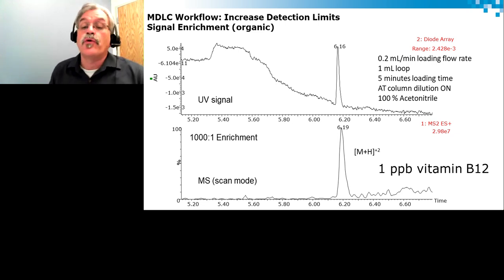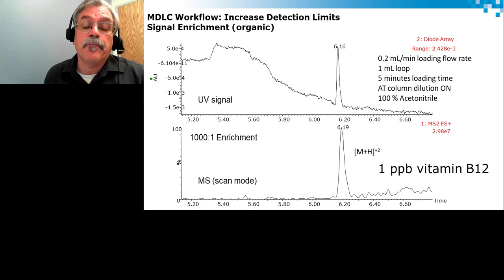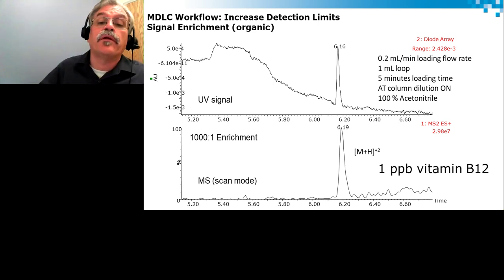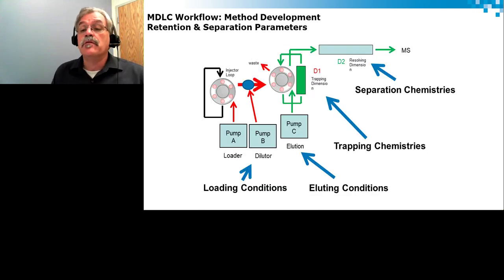Now this here was an aqueous extract, and we have the exact same thing with an organic extract. So now we have choices, and these choices allow us to utilize several conditions for method development and create a methodology for applications. That's where we're going to spend a bit more time, on how to optimize retention.